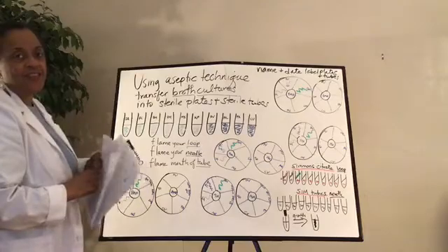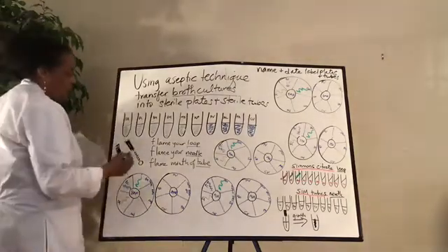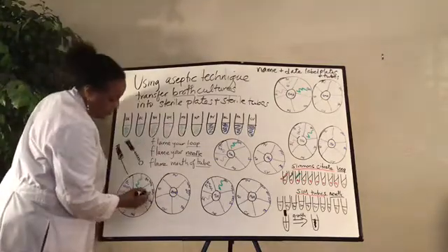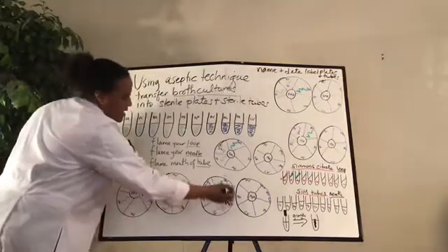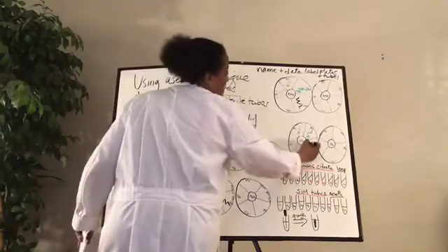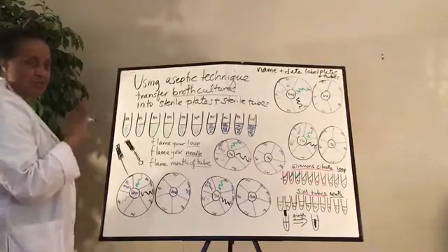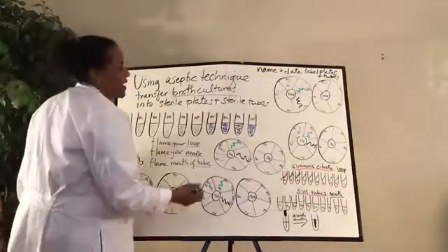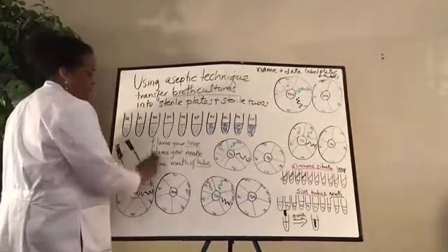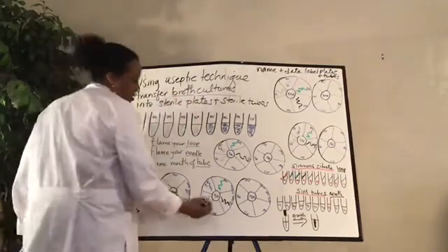You guys get the gist of this? So the point is that you will go into each one of these using aseptic technique. So SM, you will go in and inoculate SM in all of them. Some people do it like this. This is the way I prefer, because then you don't get any contamination. You just know that loop is specific for that one. And then you just go in and inoculate that one. Go in, do your MS here, and flame everything, and then go and do all your MS.